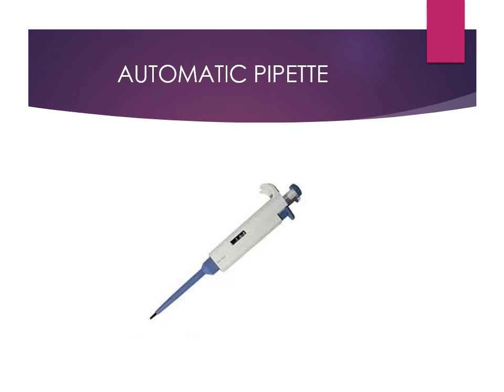That is a disadvantage, and also the automatic pipette is very precise. In the case of the glass pipette, it is not so precise because you are doing it manually. But here you set the limits, and you can take either 1 ml or 2 ml, not a big amount, but also a very small amount in microliters, like 10 microliters or 1 microliter. So you can set different ranges. Automatic pipettes are coming and they are very easy to use. So that is the automatic pipette.